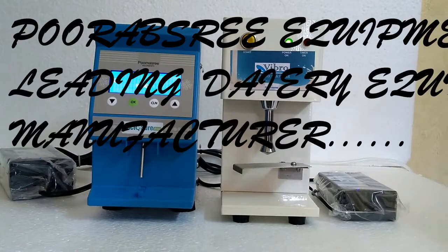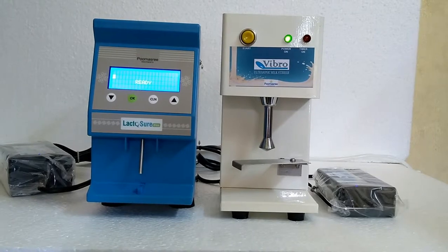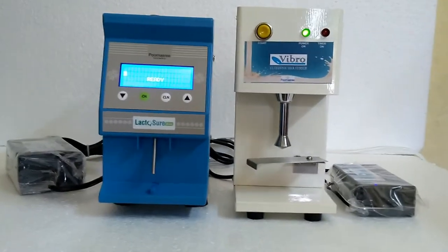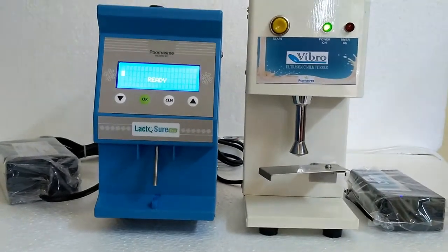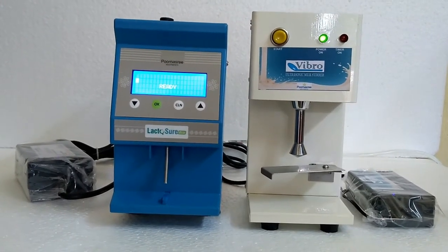LactoSure Eco is one of the widely used ultrasonic milk analyzers manufactured by Poornasree Equipments. This practical demo briefly describes how a LactoSure Eco works.